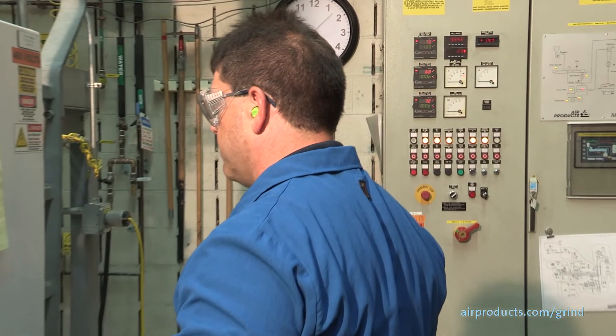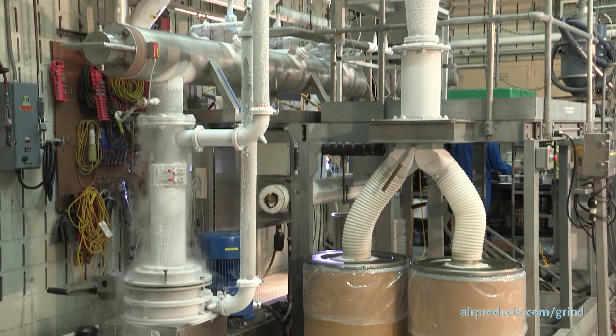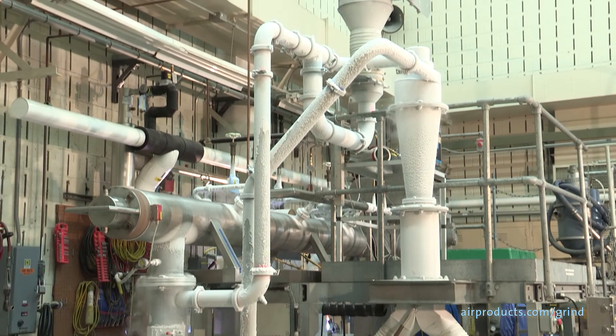There are multiple ways you can set up the liquid nitrogen flow controls. Usually the preferred method is to control the liquid nitrogen flow based on a set temperature at the mill output. The temperature feedback is provided by the addition of a thermocouple at the mill outlet.